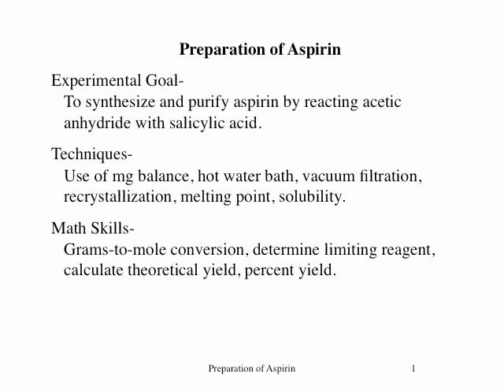Experimental techniques include using a water bath to heat the reaction mixture, collecting the product by vacuum filtration, recrystallizing aspirin from a two-solvent solution, and using a melt-temp apparatus to determine aspirin's melting point. Pertinent calculations include determining the limiting reagent, the theoretical yield, and eventually the percent yield.